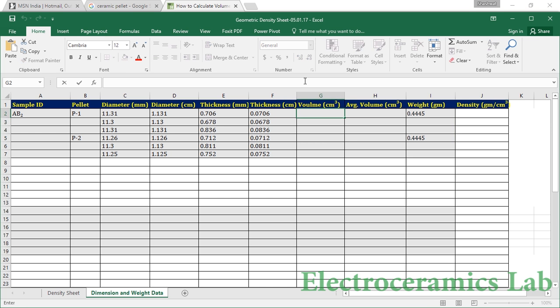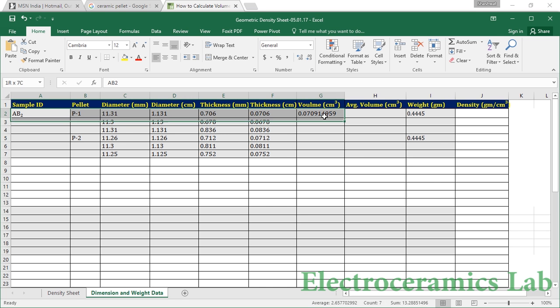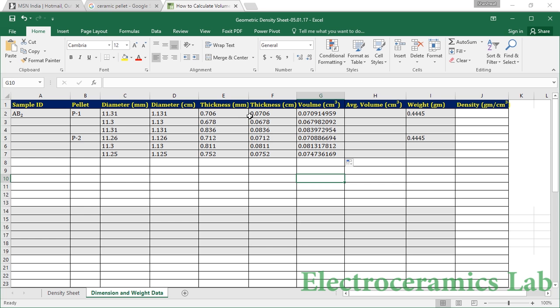The volume formula is: pi value 3.141, multiplied by r squared — where r is the diameter in centimeters divided by 2 — raised to the power of 2, multiplied by h, which is the thickness in centimeters. This gives the volume for each data set. Filling down the formula gives the corresponding volume for each corresponding data set.